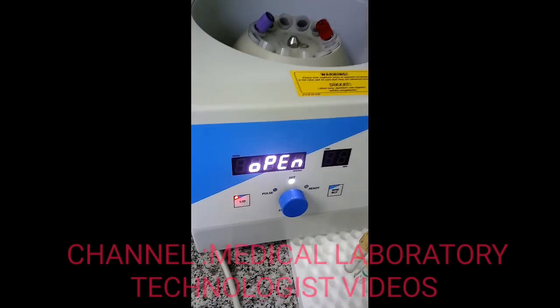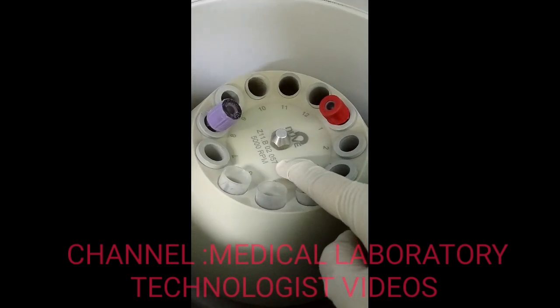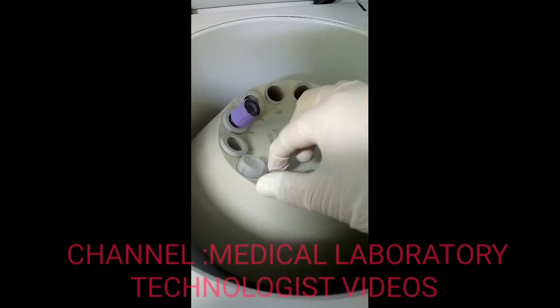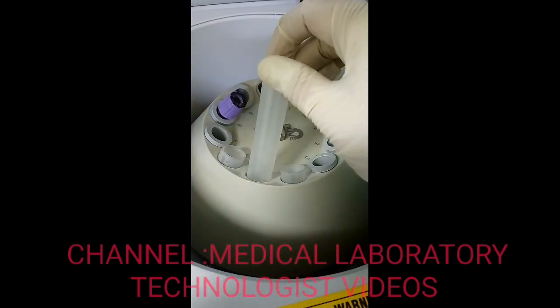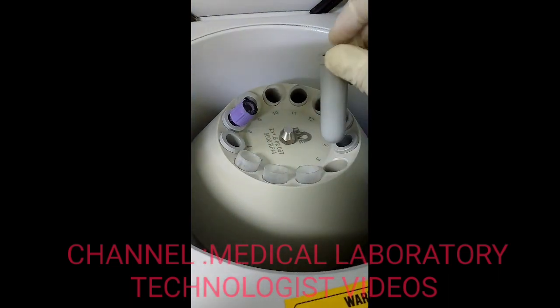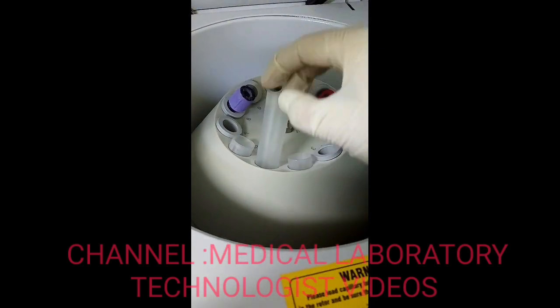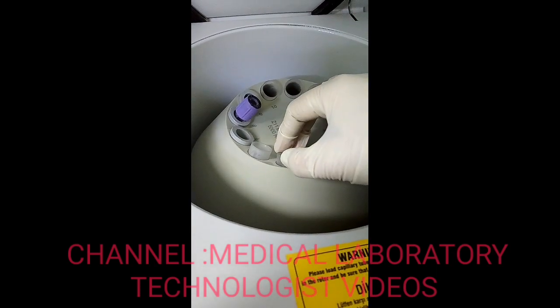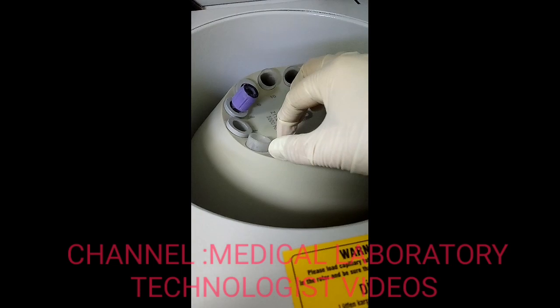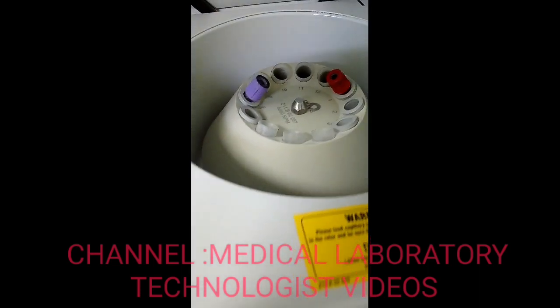As we can see, the maximum speed is 5000 RPM and there are 12 positions to keep samples. The larger tube holder is for urine centrifuge tubes and the smaller one is for sample vials. The maximum sample volume you can put in for centrifugation is 15 ml.